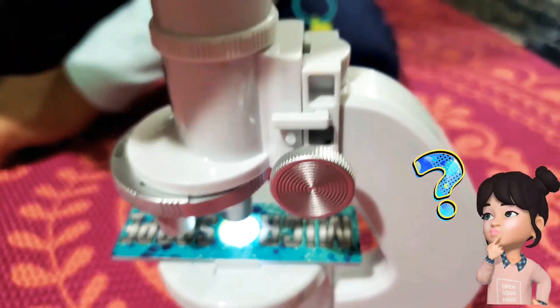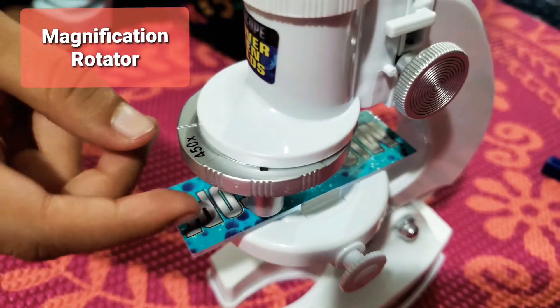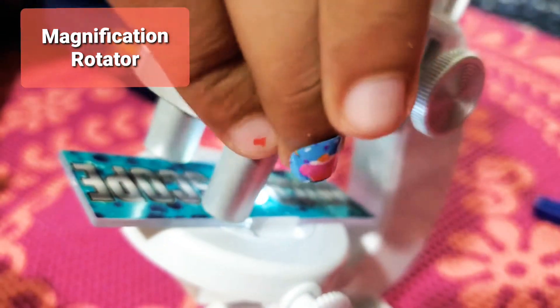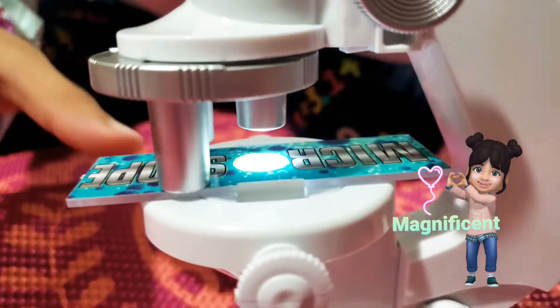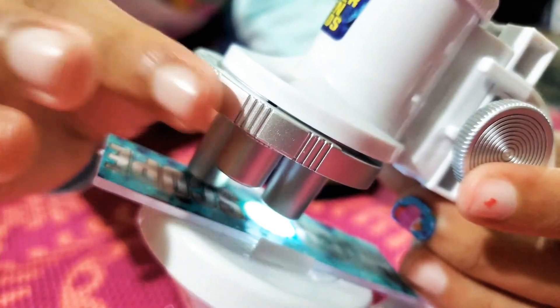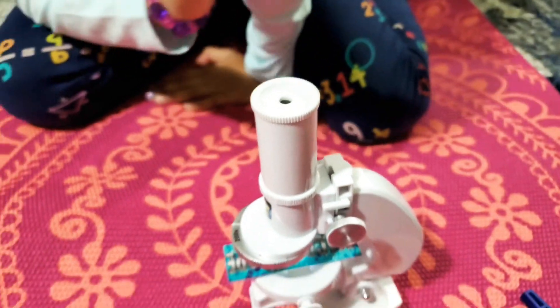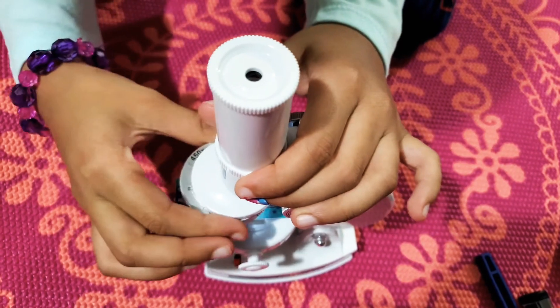Now let me see how it looks. We're going to try the magnification settings. Here we have 450x, which is the longest one. Here we have 200x, which is the smallest one. And here we have 200x, which is like medium. So let me have a look — I'm so excited. First let me put it on the longest one, which is 450x.